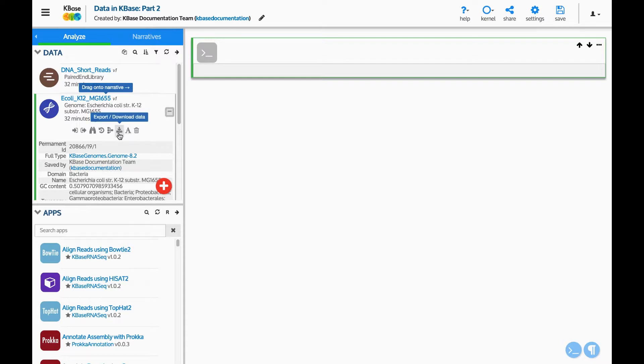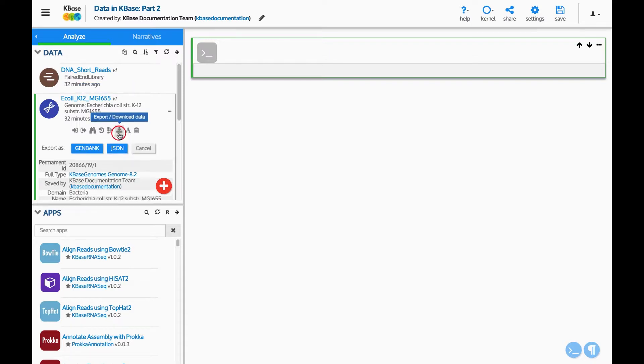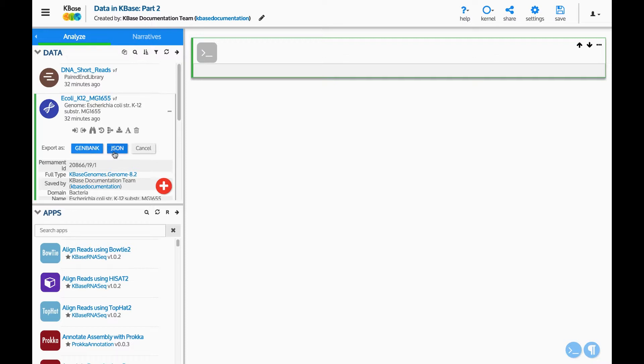The button with the downward arrow is for downloading this data. Different types of data have different download options. Currently, genomes can be downloaded as a GenBank file or as a JSON file. JSON is a raw format used by KBase to encode data objects.